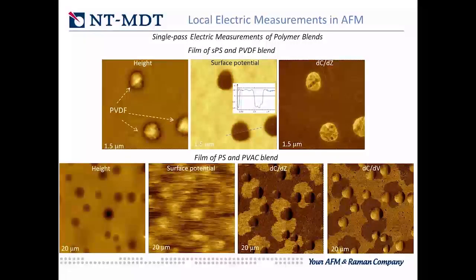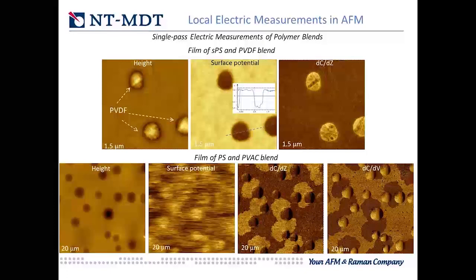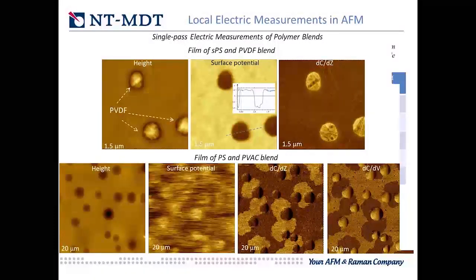Plus, on this thin film, we already succeeded in combining AFM with confocal Raman, and that gives us additional support. Here, because you see in the DCDZ and DCDV maps, we have a lot of contrast. Not everything is understandable because there are contributions from the top layer and from the bulk of the system. Therefore, sometimes AFM is not enough and you need to combine it with, let's say, confocal Raman studies, where you can collect information from thicknesses of around 400 nanometers. That will provide the means for comprehensive compositional mapping using not only AFM but its combination with spectroscopy.